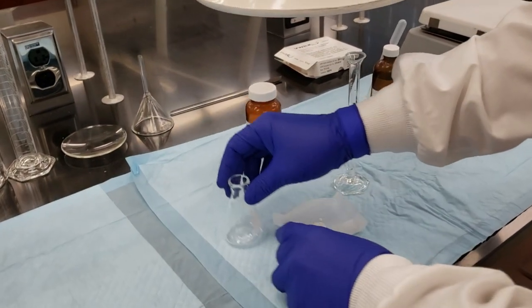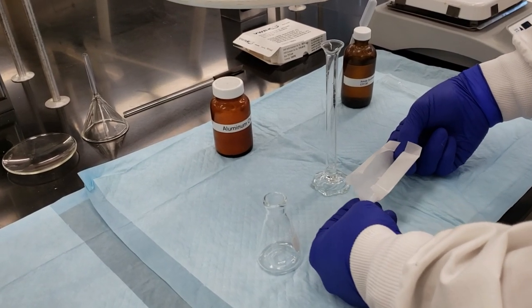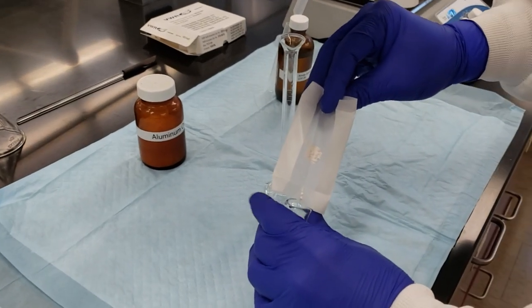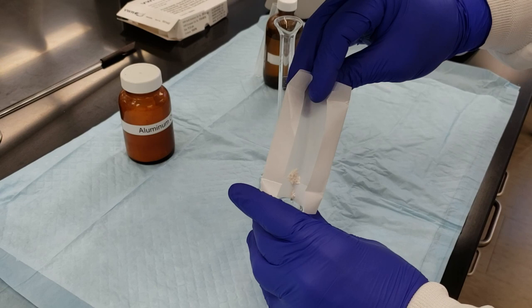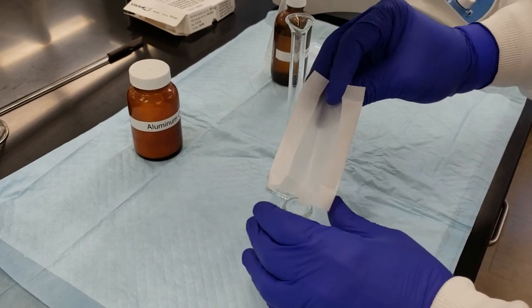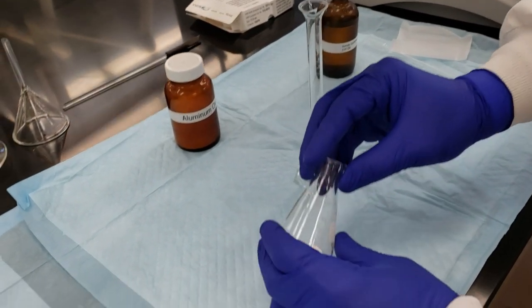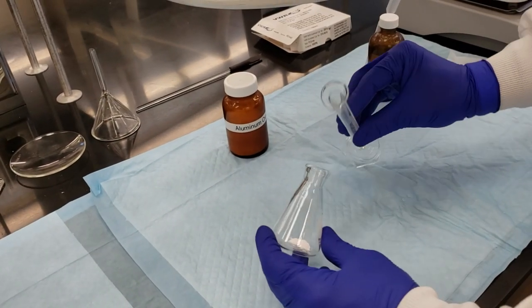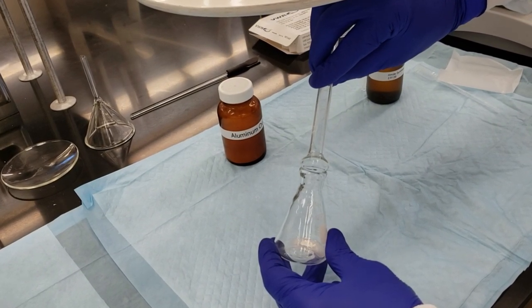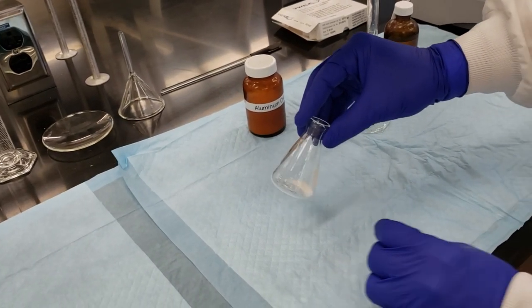So first step is going to be adding our aluminum oxide. Carefully bend my weigh paper here. Tap our paper so that our powder will fall into the flask. And there we go. I'm going to gather that to one side of the flask. Then I'm going to pour in my 1 mil of my unknown amine. All right. We formed a slurry of our catalyst and our amine.